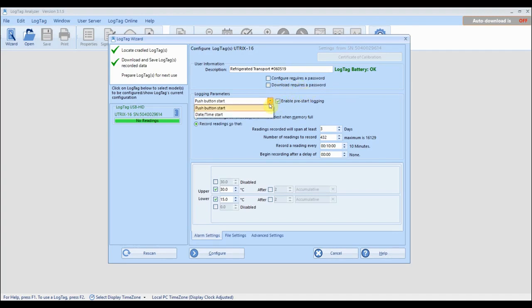Select if you wish the logger to start recording at a specific time and date or when you push the start button.